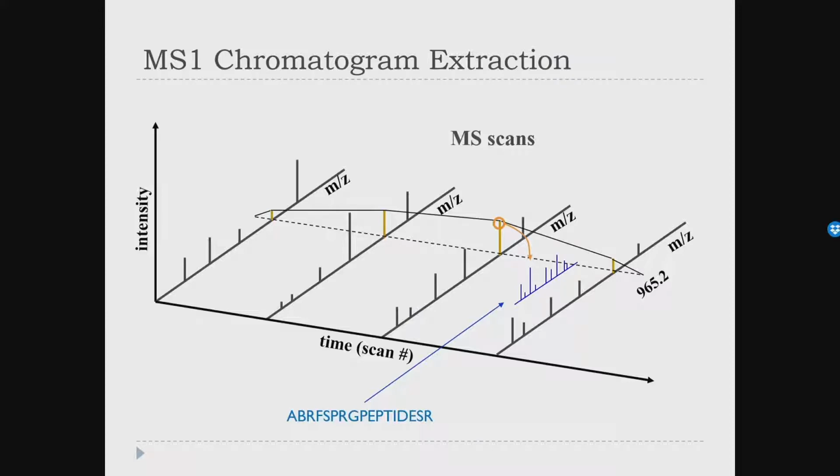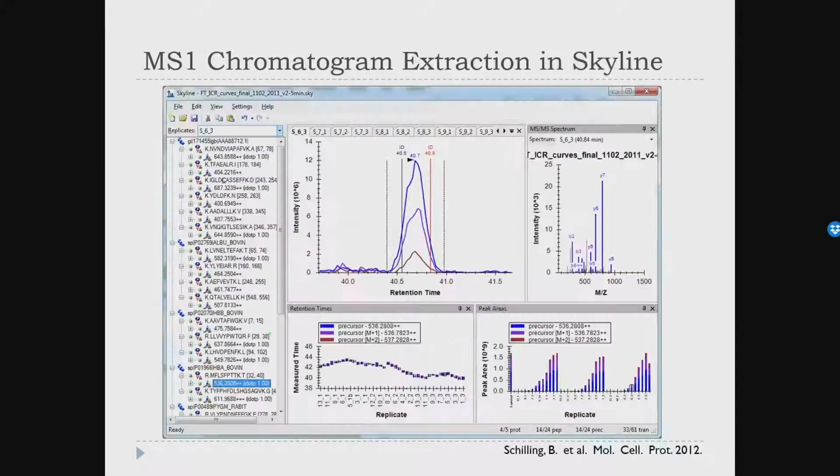Lots of tools do this. Probably the most well-known are MaxQuant and Mascot Distiller. Basically they use these IDs, and then they extract MS1 chromatograms. And if there's an MS spectrum that's identified as a certain peptide that happens in the middle of that extracted peak, then we have a lot of confidence that that peak and the area under that peak represents our peptide.